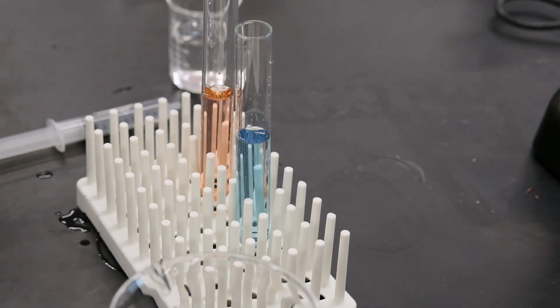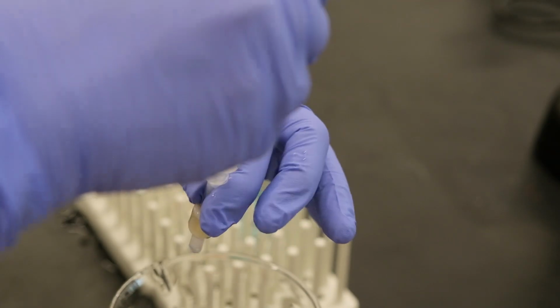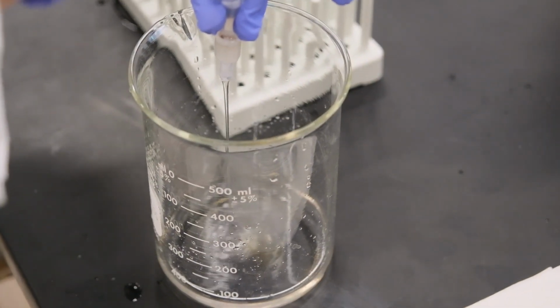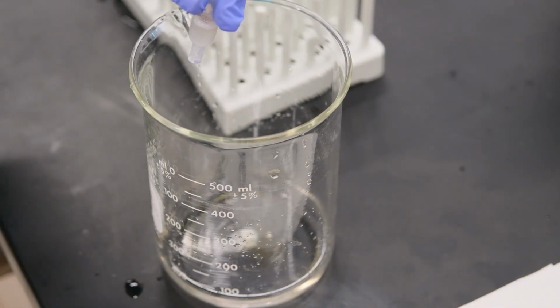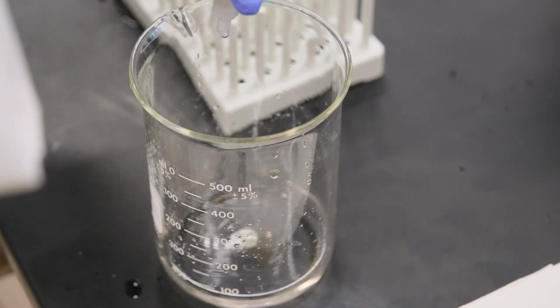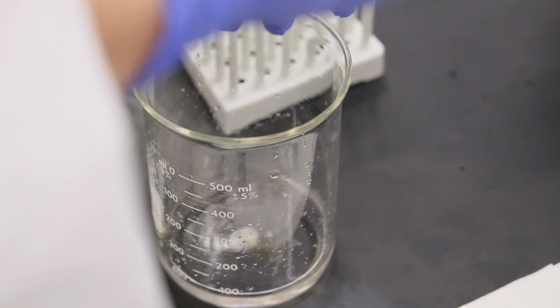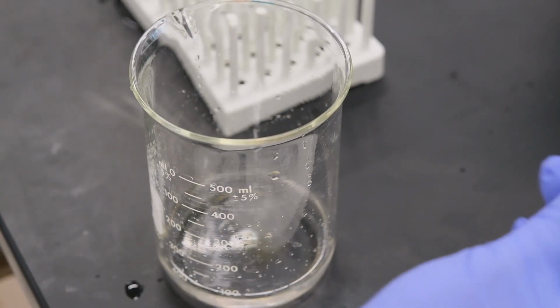At this point, we wash our column immediately with 70% isopropyl alcohol, and this goes again in the waste. And then we remove the excess of alcohol with deionized water. Now the cartridge is clean.